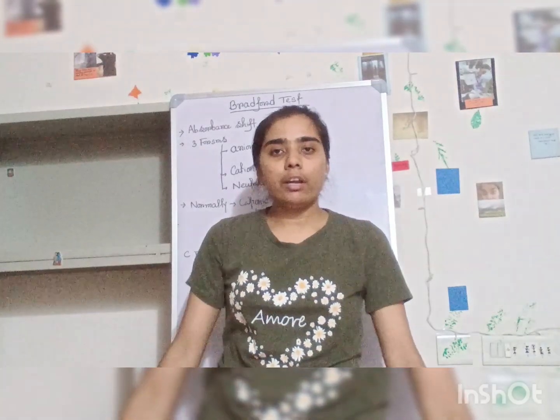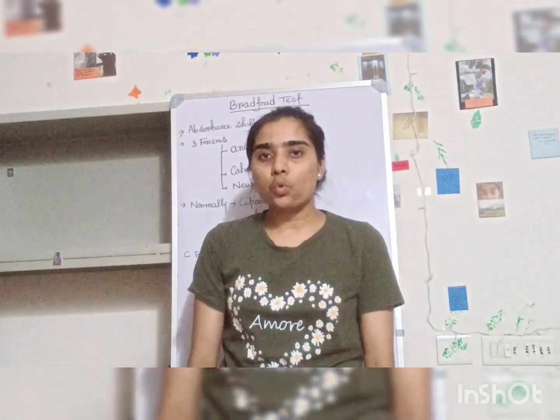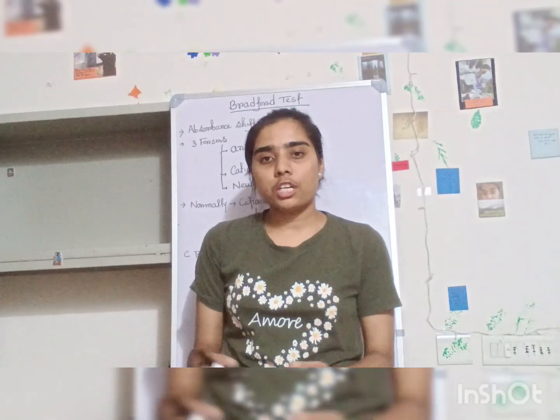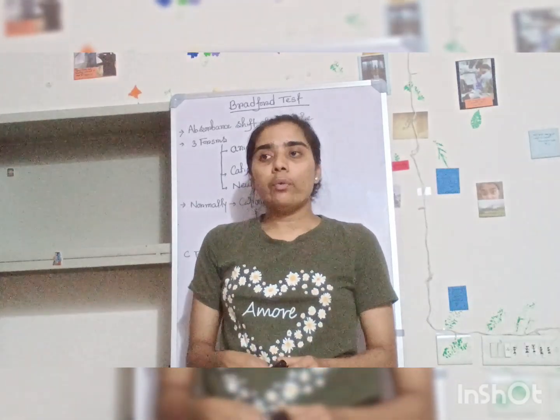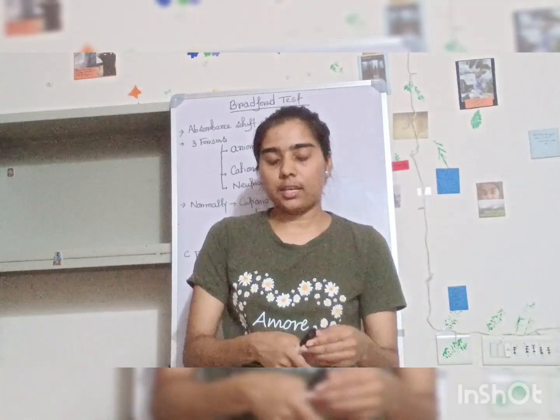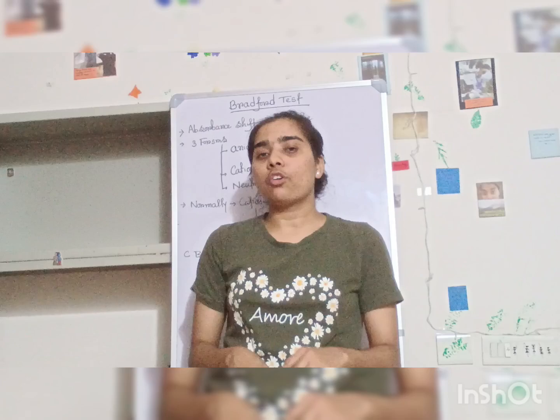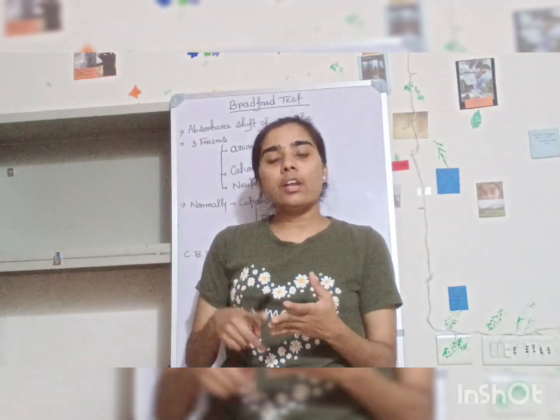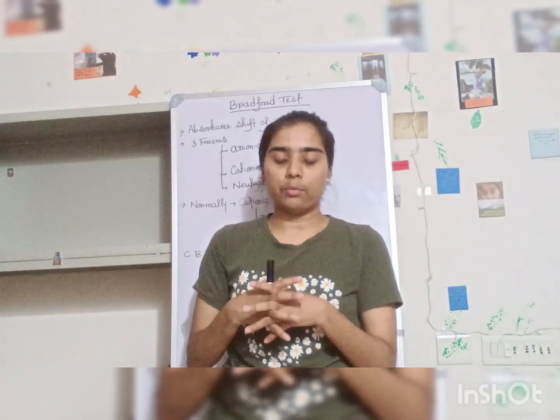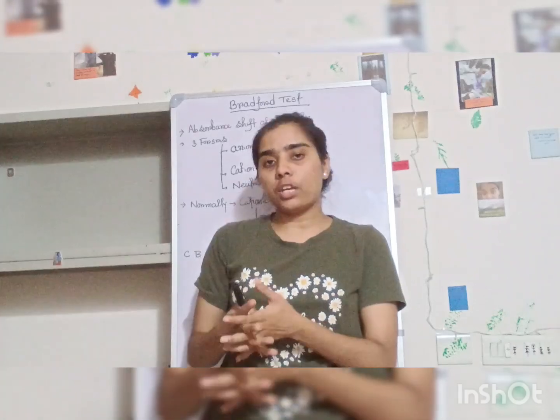So today we'll talk about one assay called the Bradford assay. Now, why do we need to know about the Bradford assay? If we want to measure the concentration of any unknown protein, we have to do different kinds of assays, like the Bradford assay. There are other methods as well through which we can detect the protein concentration, but Bradford is the most used assay in the laboratory. In any biochemical laboratory you can see people do the Bradford assay to check the protein concentration.